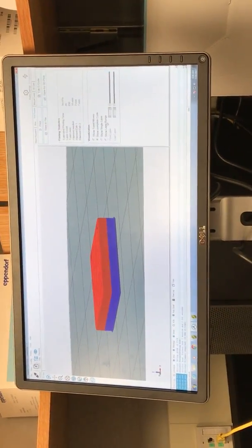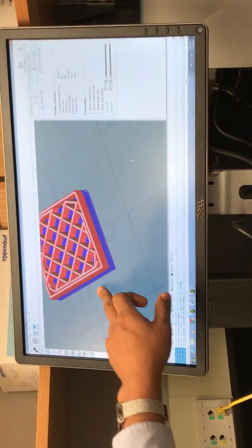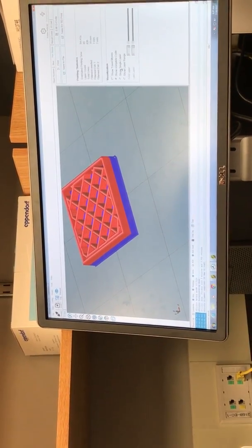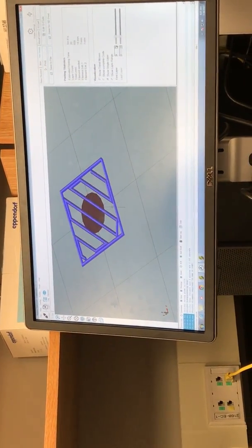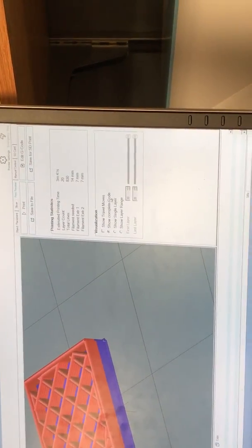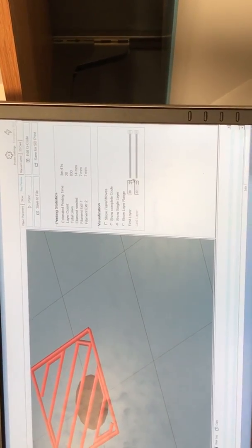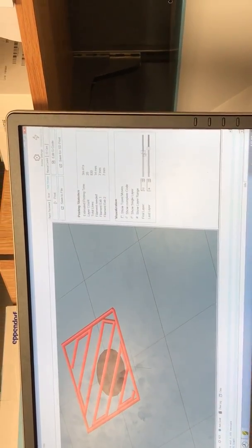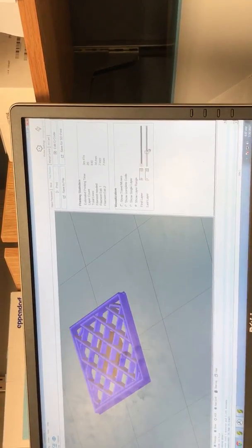So now here, this is the slice file. So here, for example, we can show every single layer of the complete code. As we go through each layer, it will be printhead 1 and then printhead 2. How'd you do that? Here, in print preview, after you slice, it will give you these options. You can show the complete layer, show single layers, show range.